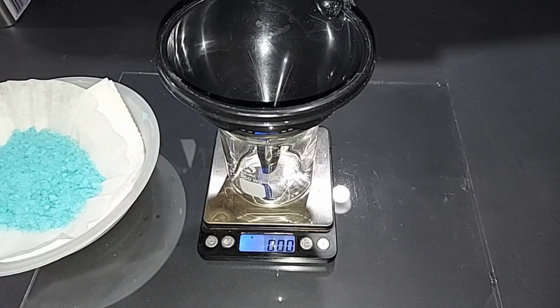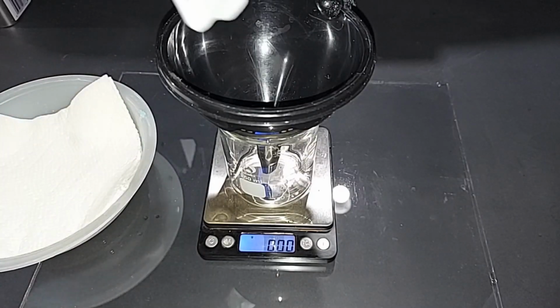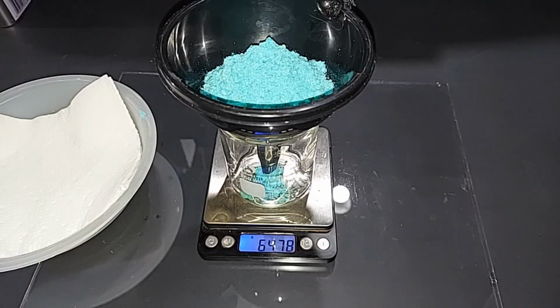Okay, let's weigh our copper 2 chloride dihydrate. 64.78 grams. Okay, that's a decent amount. I'm not sure how much the total will end up when I'm done dehydrating the other solutions, but it's a good start, and I'm very happy with the end result, especially the purity of this copper 2 chloride.